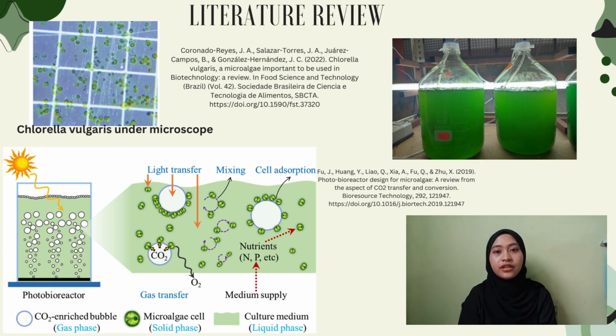To be specific, the vigorous mixing induced by aeration of carbon dioxide enriched gas bubbles could lead to internal flow of microalgal suspension and prevent cells from settling to the bottom and adhering to the walls of photobioreactors. The mixing of nutrients and microalgae cells with the internal flow ensures the uniform distribution of nutrients to the cells and high microalgae growth rates. Besides, the mixing also guarantees that all microalgal cells could be equally exposed to the light energy, hence enhancing carbon dioxide molecule transfer from the bubbles to inside of the microalgal cell.